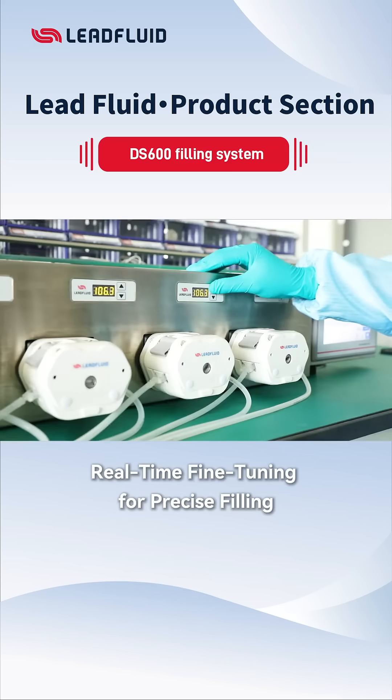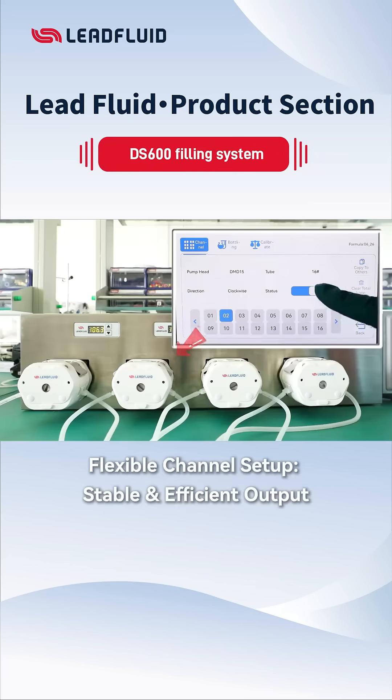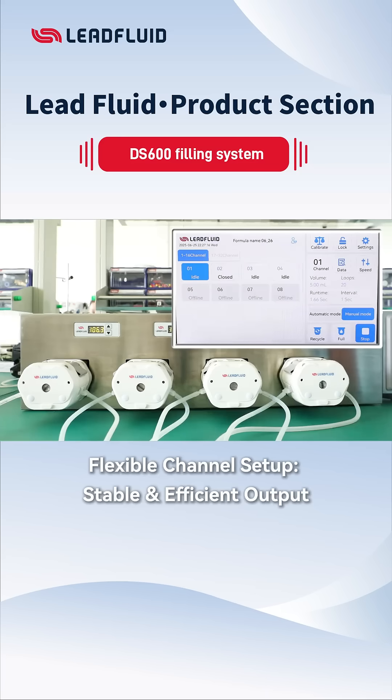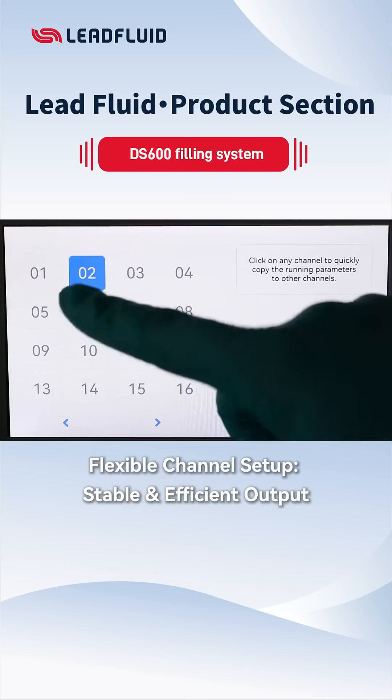Adjust filling deviations instantly with real-time fine-tuning. Control channels individually or copy settings across batches easily.